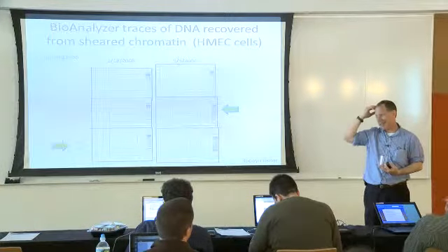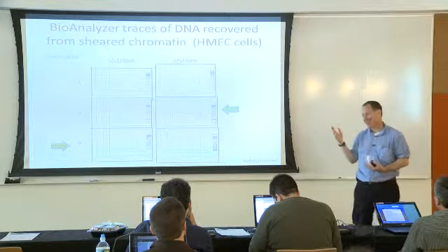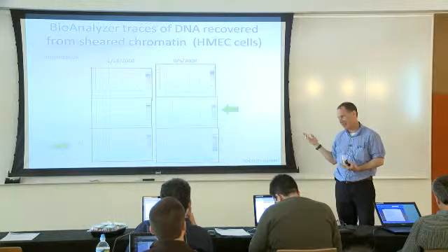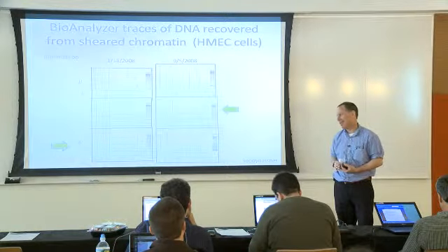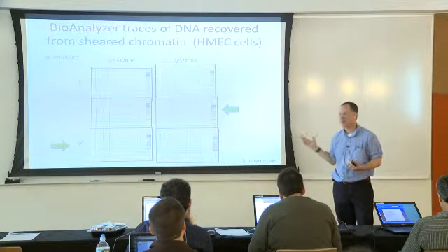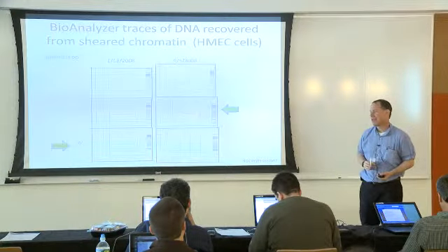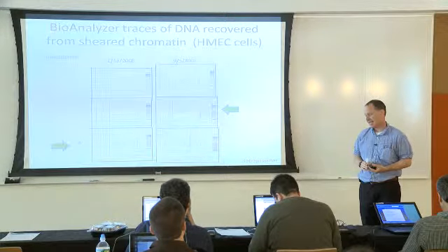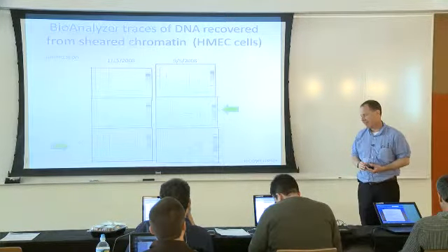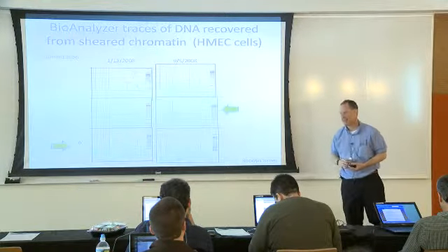And the answer is shoot for the middle and try to do things as reproducibly as possible. But that's a very real problem, which, frankly, as recently as last week, we ran into a manifestation of that problem where we were trying to work with about 30,000 cells in a ChIP. It's a tricky problem.